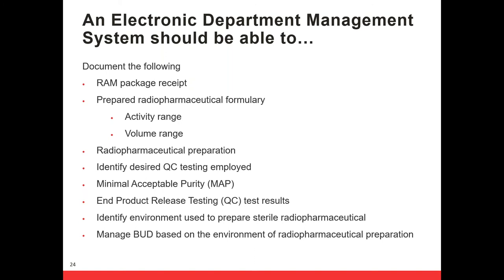It should walk you through the radiopharmaceutical preparation, and should walk you through the QC. It should give you the QC results and do the math for you. That's really what we're looking for. An important part of that is, does it pass QC, does it fail QC? And what happens if that were to occur? Can I accidentally administer it to a patient because my system didn't stop me if it failed the QC process? We should be able to do that.